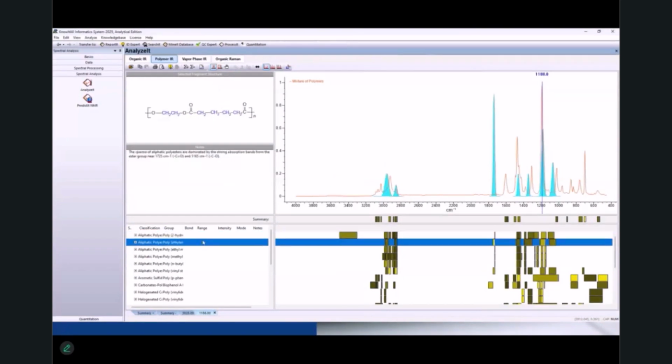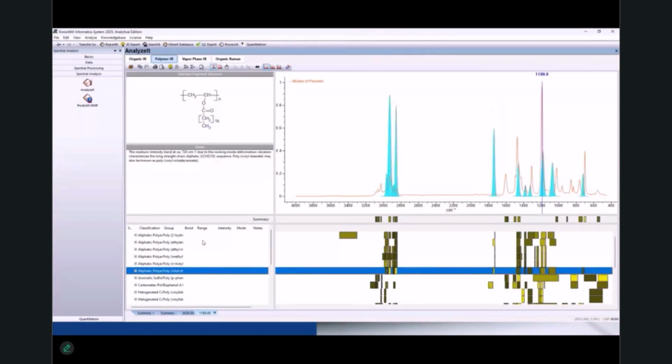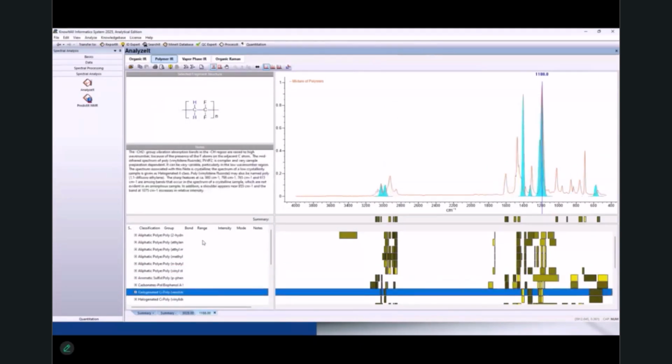All right. Let's look at some options here. Some of these peaks aren't really aligned around 1200. Don't like these ones either. That one looks pretty good, so I'll add it to my summary as well. It's the same kind of process. And then from here, I can do the same thing, and I can see that there are two different kinds of polymers in this mixture at least.